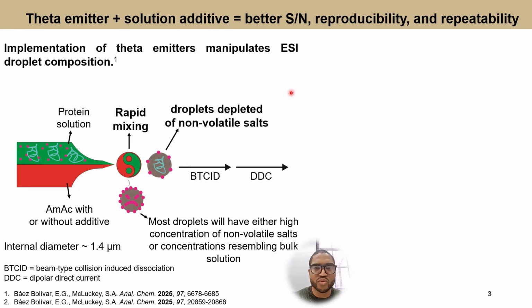To make a long story short, we published a couple of manuscripts last year where we basically demonstrated that the implementation of theta emitters is very useful for the mass analysis of proteins and protein complexes dissolved in physiologically relevant concentration of sodium and commonly used biological buffers. Although we didn't characterize extensively the mechanism, we reached the conclusion that implementation of theta emitters manipulates ESI droplet composition.